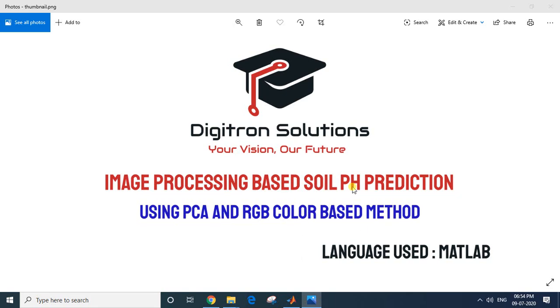Hello everyone, good evening. Welcome to Digitron Solutions. In today's video I am going to demonstrate the working demo of the project: Soil pH Prediction — that is, image processing based soil pH prediction using Principal Component Analysis.